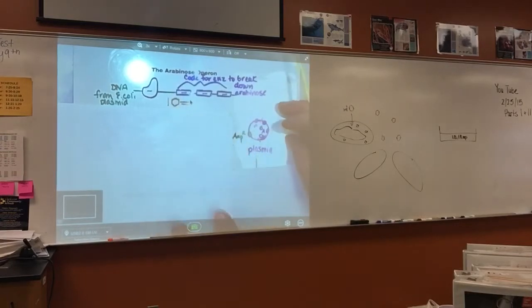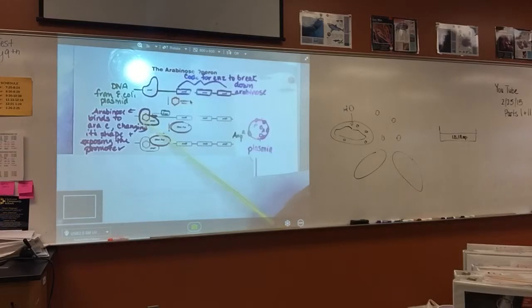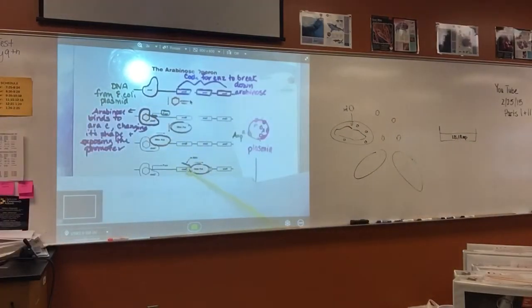If arabinose is present, look at what happens. The shape of the ARA-C changes. That shape change exposes the promoter region, which means that now RNA polymerase can combine and transcribe the gene and make the mRNA, and therefore that can make the enzymes to digest arabinose. This is what's naturally found in nature and what happens in nature with bacteria that have this particular plasmid.